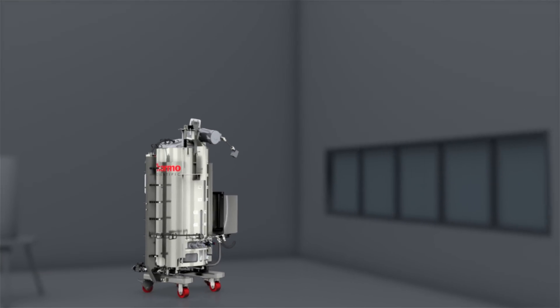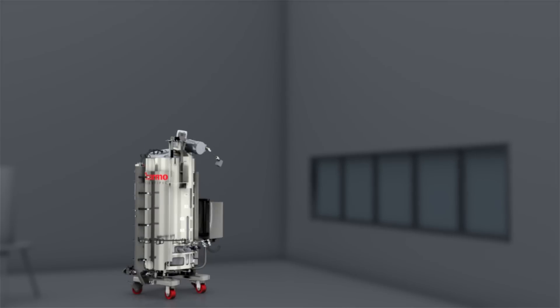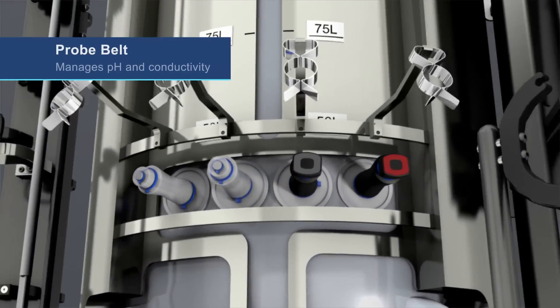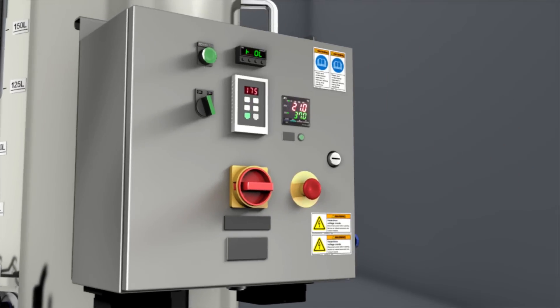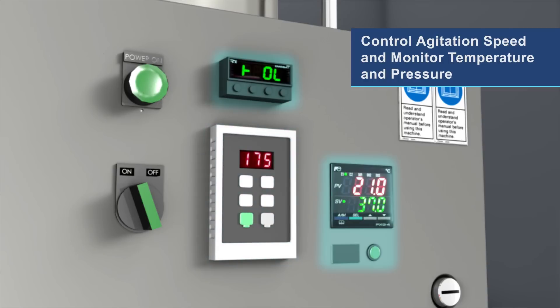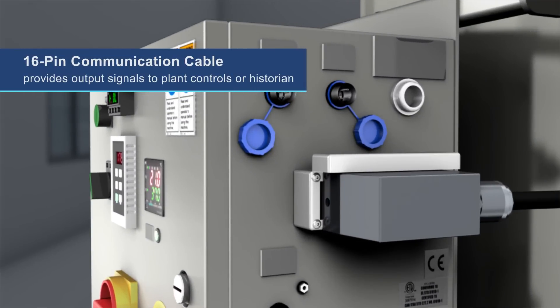Fully enclosed sterile BPCs provide for secure pooling and intermediate storage stages. The SUM is equipped with a probe belt to manage pH and conductivity, and includes an electrical box which controls agitation speed with the capability to monitor temperature and pressure. The 16-pin communication cable provides output signals to plant controls or historian.